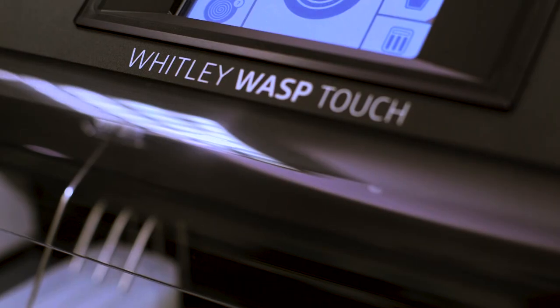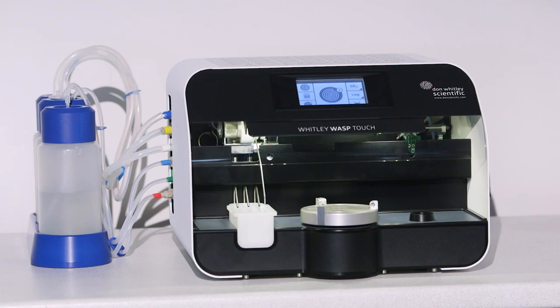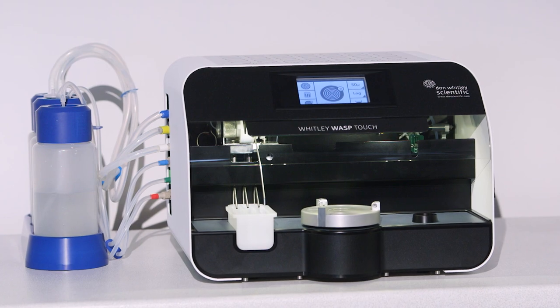Wasp Touch has a transparent cover over the working area that minimizes the risk of airborne bacteria affecting results.